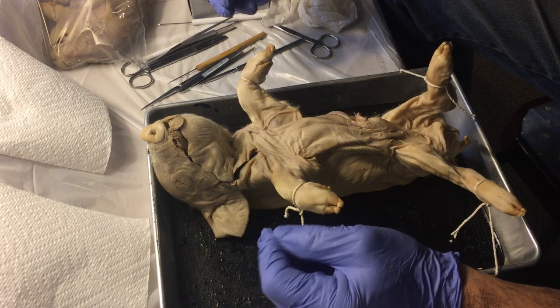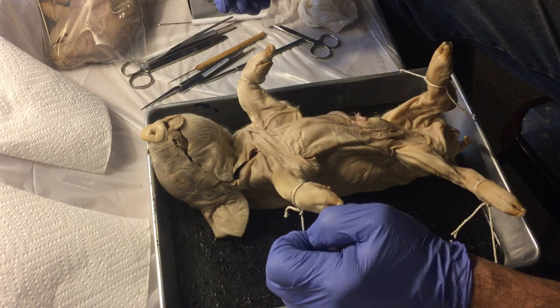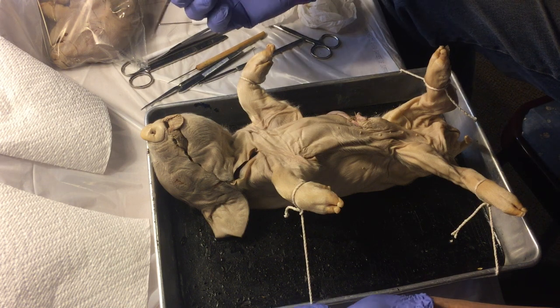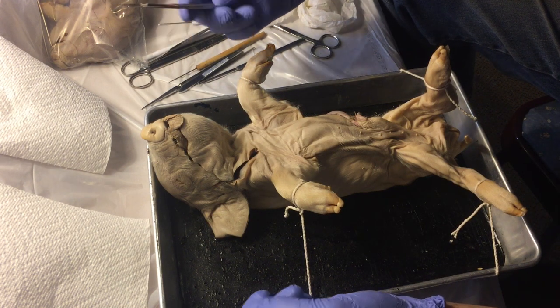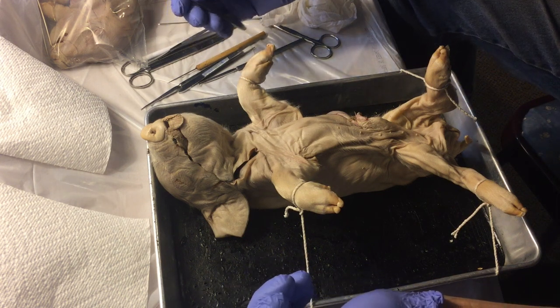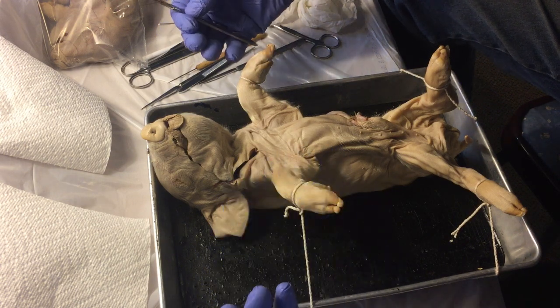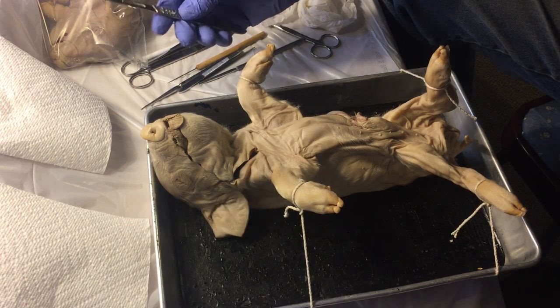Welcome to human biology class. We're in the basement with Becky doing a fetal pig dissection as promised. We're filming on an iPhone and Beck's going to zoom in and out. The idea here is to give you a general idea of how the human body is put together. We're using a pig model because pigs are fairly close to that.